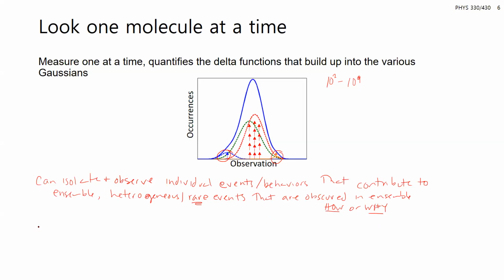So today, like I mentioned, we're going to talk about fluorescence, but single molecules can also be detected by other optical methods such as absorbance. It's much more challenging. Or Raman scattering, again very challenging. Fluorescence is the typical optical way.